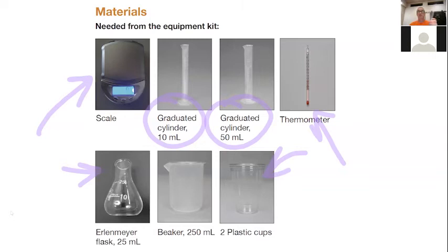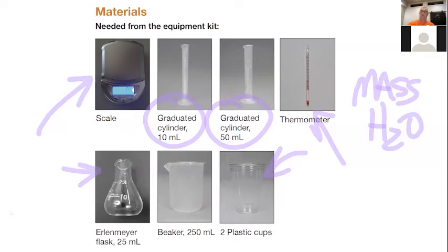And we pretty much know that the density of water is dependent on the temperature. The hotter it gets, the more the molecules start moving around. They start moving a little further apart from each other, and that makes the density go down. So we're going to get the mass of the water, and then we're going to convert it into a volume, and then see how close we got to, for instance, 7 mils of water in the 10 mil cylinder.